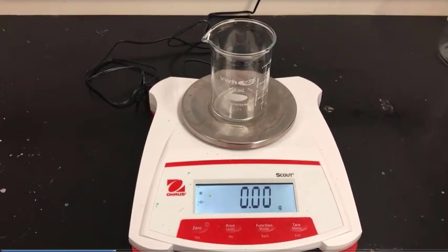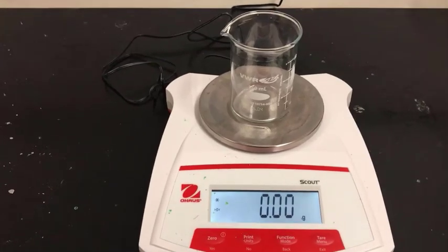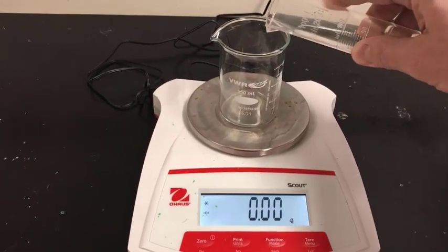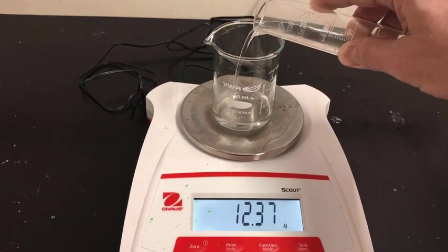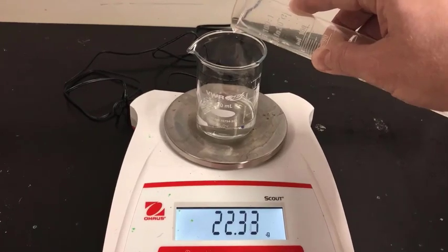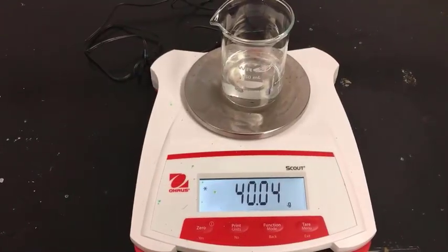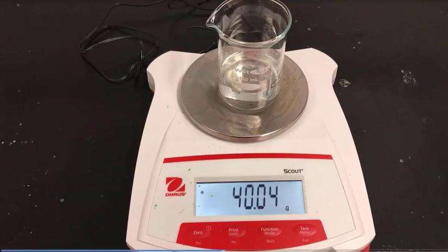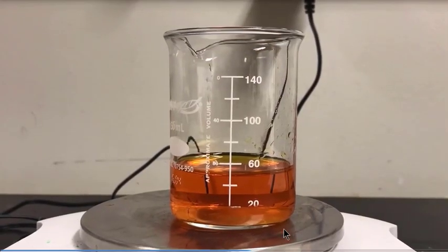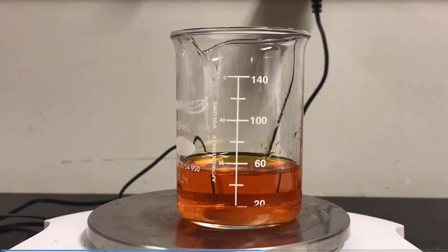Tare or zero the balance before you start adding the water. So now you're just measuring the mass of the water itself. Get it as close to 40 grams as you can. You can see here I stopped at 40.04. Now we're going to look at the volume in the beaker from that 40.04 grams.